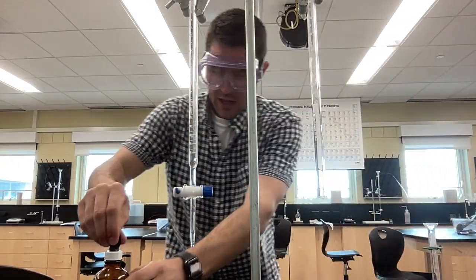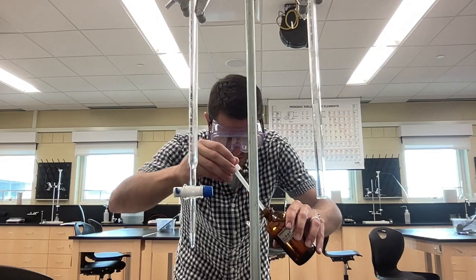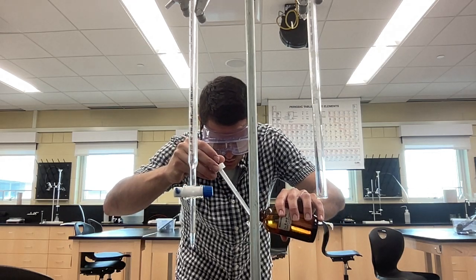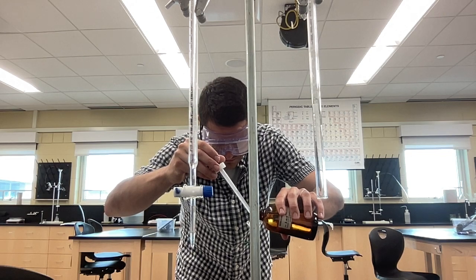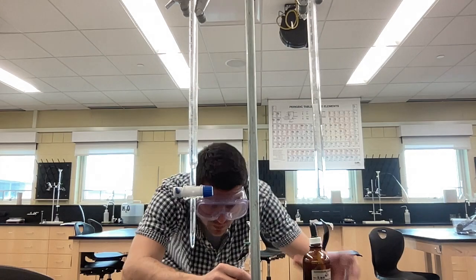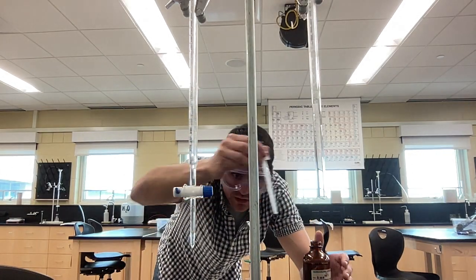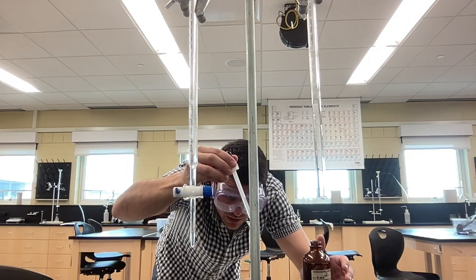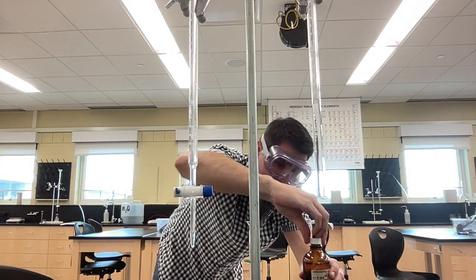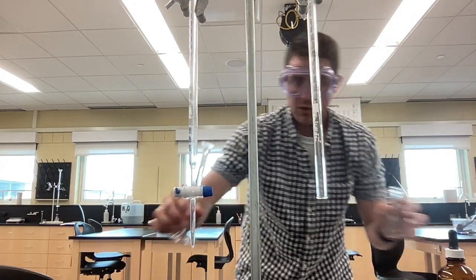I'm going to add about 10 milliliters of it to an Erlenmeyer flask. So let's go ahead and take it out. Let's dump some in. I don't want to go too high. I don't want to dump back out. Okay, let's go to the dropper now. I poured some in. Let's drop till we get to 10. Bam, 10 milliliters. I've got 10 milliliters of acid, 0.5 molar HCl.